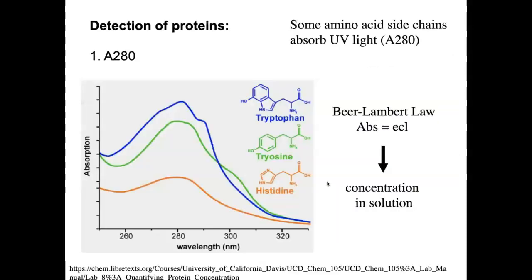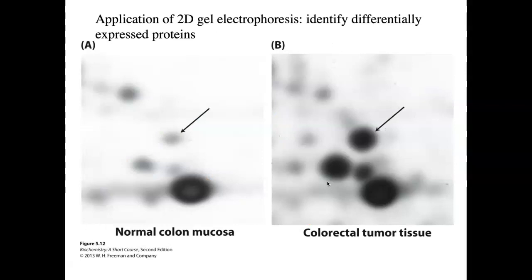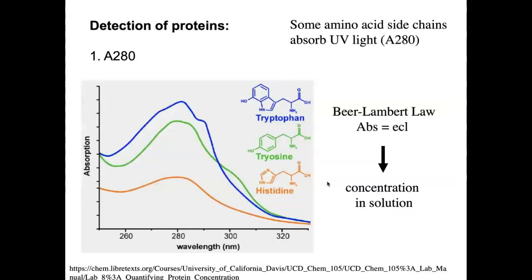So next we're going to think about detection of proteins, because what you see here is a gel that's been stained, because normally most proteins are not colorful. They're not visible. Think about egg white, right? It might have a little yellow tinge there, but it's mostly clear before it's cooked. And so when we want to detect protein, we have choices.